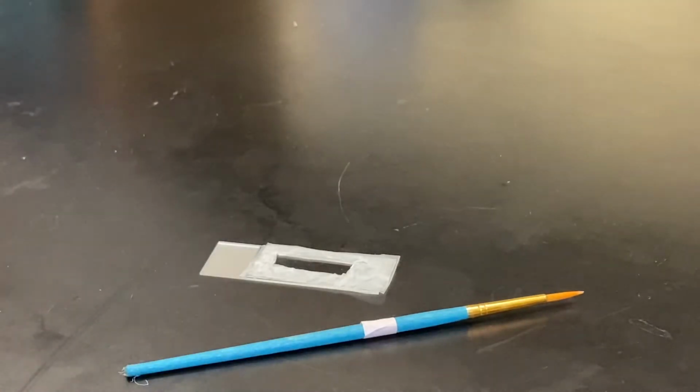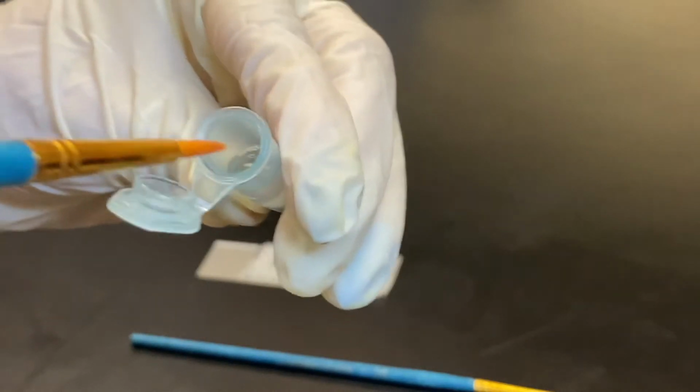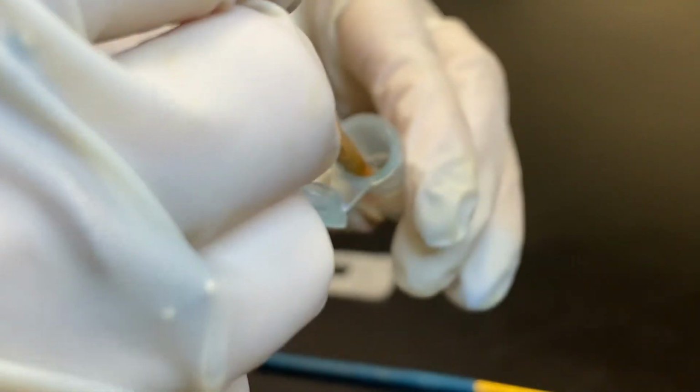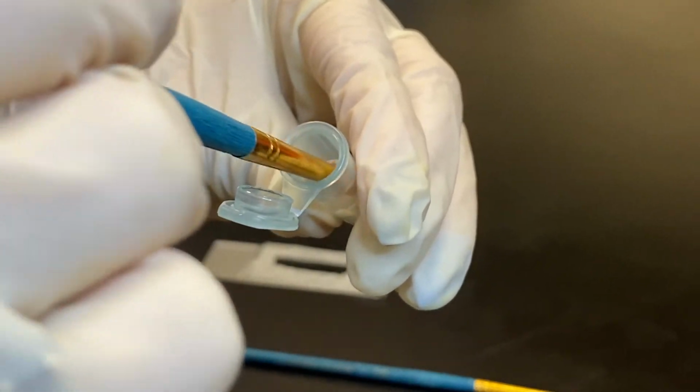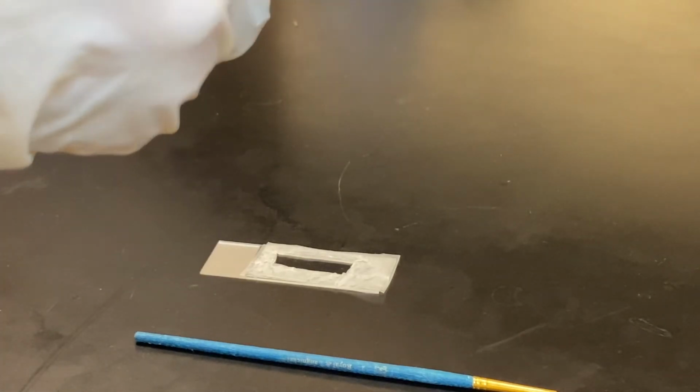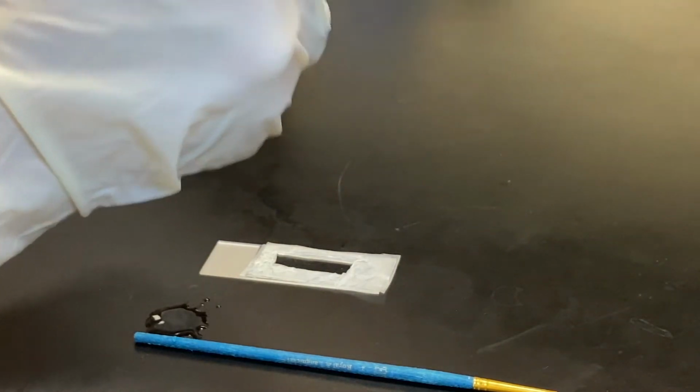I started getting ready to remove the brain and place it on the slide, but literally as soon as I touched it to the water, the whole thing started to dissolve. The brain was just gone. I panicked and tried to fix it, but there was honestly nothing I could do at this point other than make more of a mess. The more I touched it and tried to fix it, the worse it got.